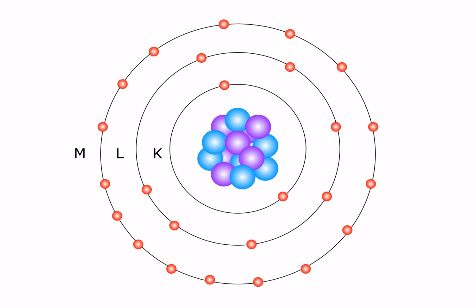Now, the atom is nice and happy, a little more stable. A couple points of terminology here. Because this is electron, photon, essentially subatomic particle interactions, we're dealing with quantum mechanics, not the laws of physics you and I use every day. So as a consequence, we're dealing with probabilities, not certainties. So we can only say if something is more or less probable. We can't actually predict it very well. However, at least for individual cases, when you have hundreds of thousands or millions of cases, then the probabilities emerge quite regularly, and you'll see this in your spectrum when you take data.